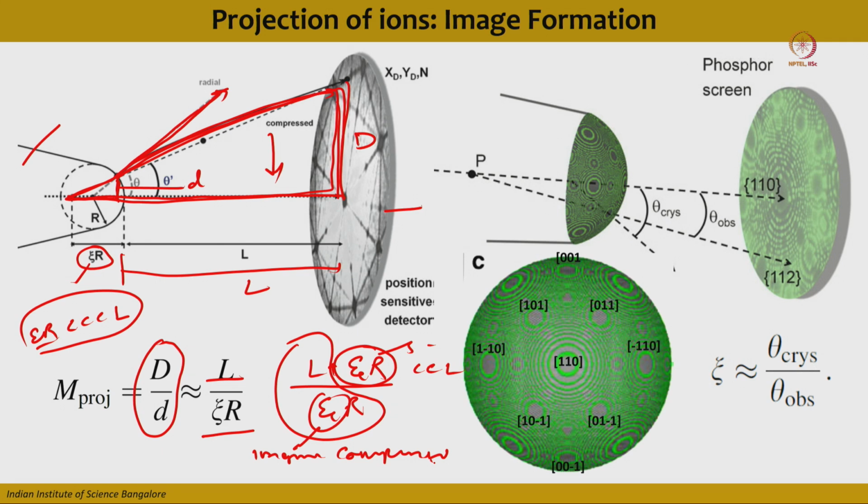And we also talked about crystallography. As I told, in the FIM image you have these concentric rings, and these rings correspond to a particular crystallographic direction. This is a FIM image of a tungsten BCC needle specimen, and you can see that these concentric rings are exactly at certain crystallographic directions. These are nothing but the stereographic projection.